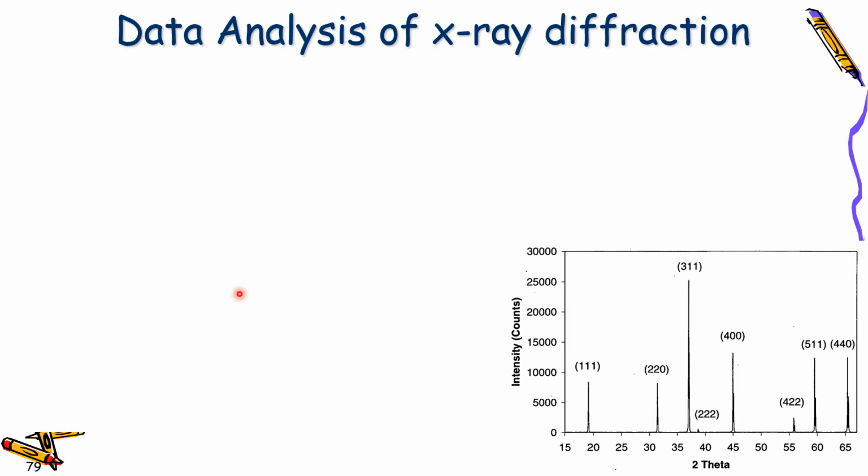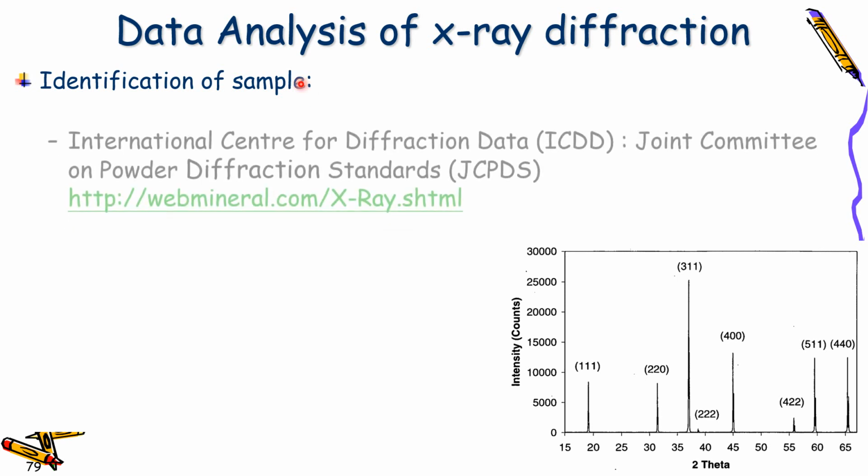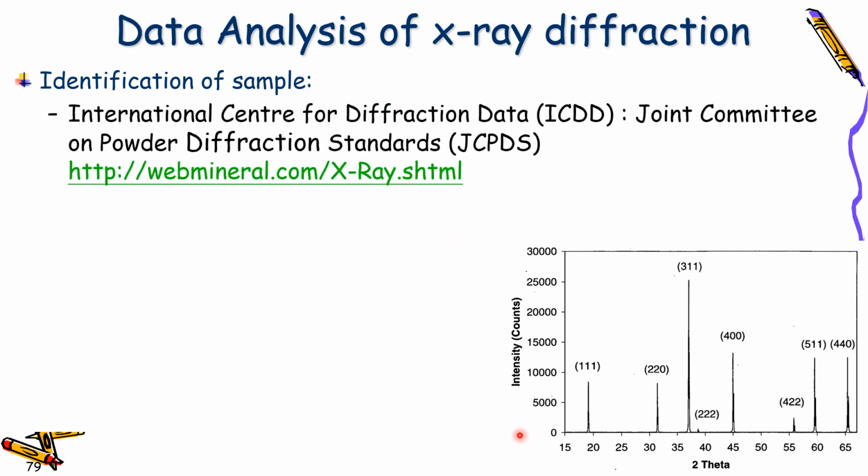Right. So for the data analysis of X-ray diffraction, as I just mentioned, we can identify the sample. When you get a set of patterns like this, you can check this database and the computer will analyze it for you.